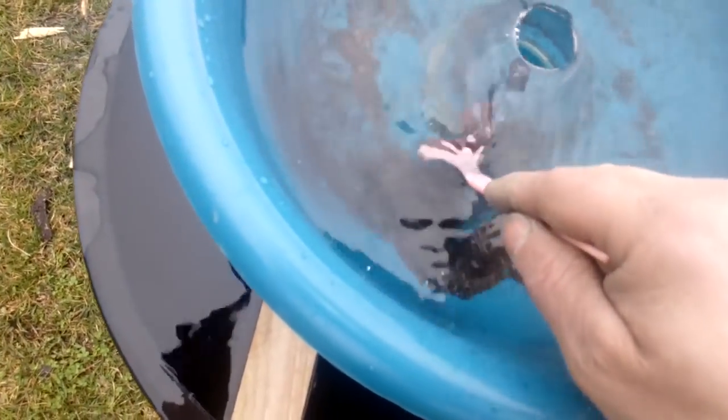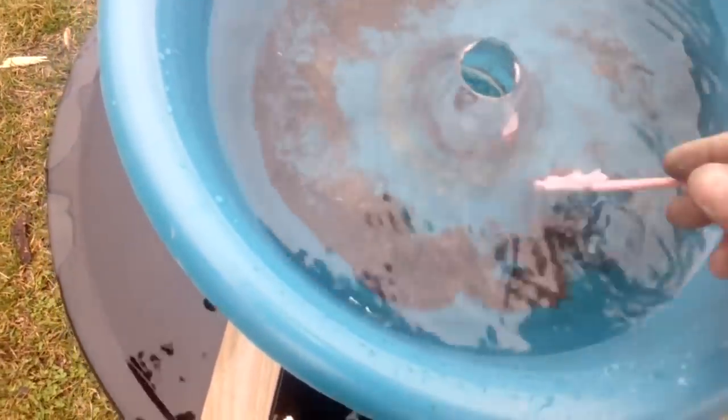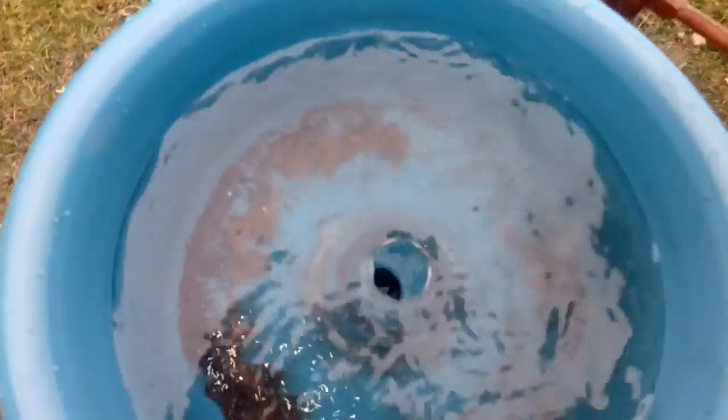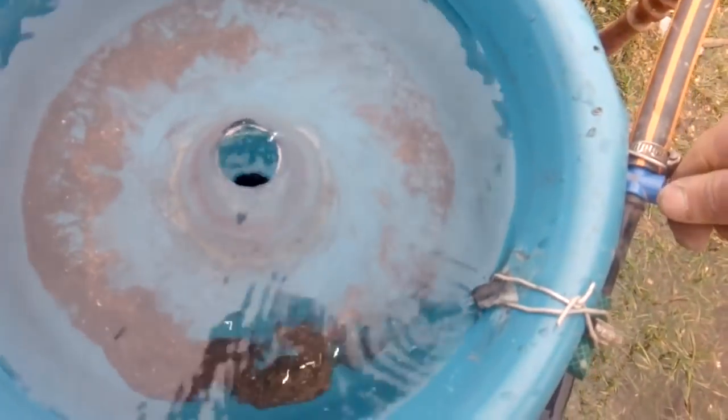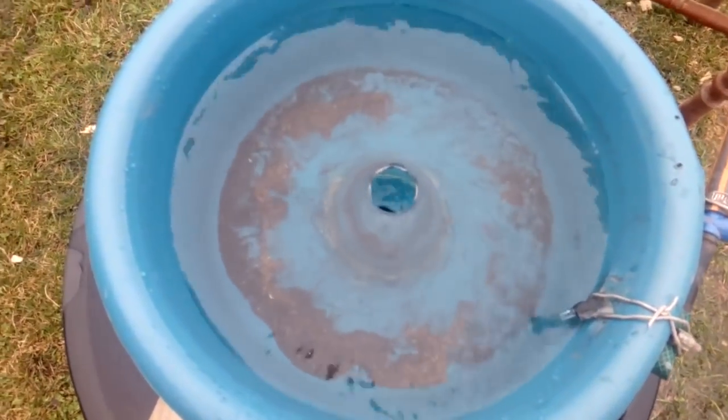And start again washing, and remove all that leftover plastic. Now it's finished. Let's see what it looks like. It's better to leave a little plastic than to put too much pressure with water and remove all the gold.